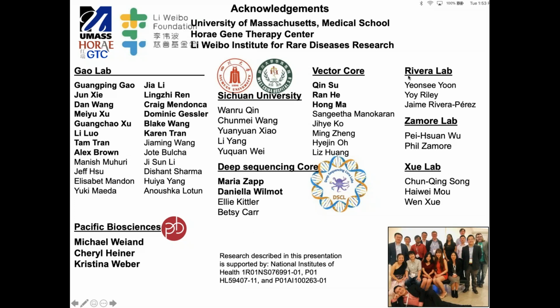Another question, could you go into a bit more detail about sequencing single-strand AAV, library prep and analysis? Is it the same method as the self-complementary AAV publication? So we've actually made a few advances to reading out the single-strand AAVs.